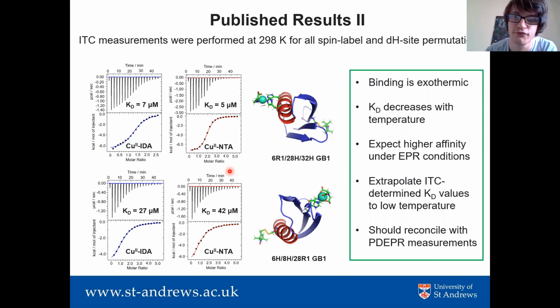I would imagine that the label falls off pretty quickly. So ideally, you would do the spin labeling as the last thing, and troubleshoot everything else before getting to that step.